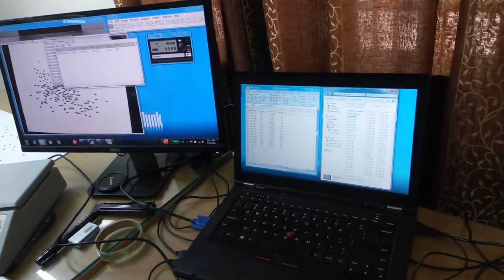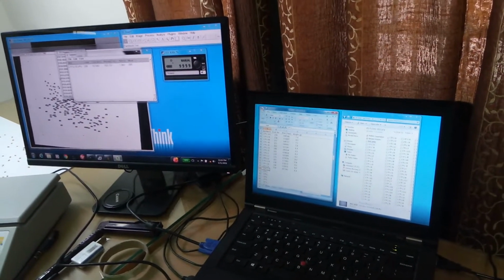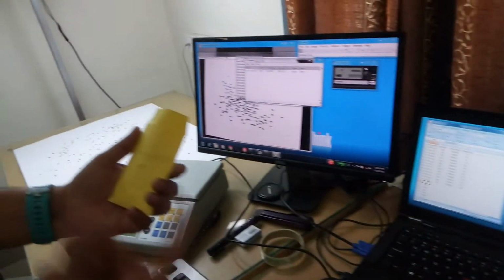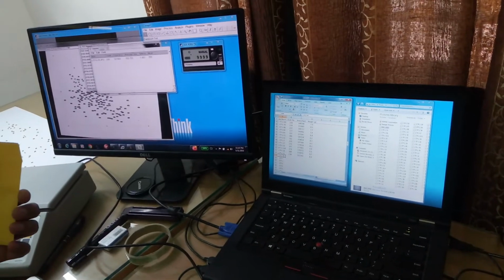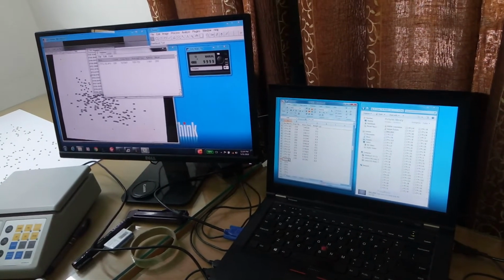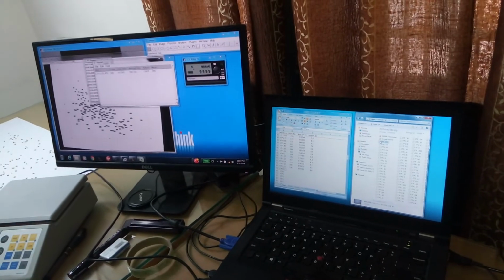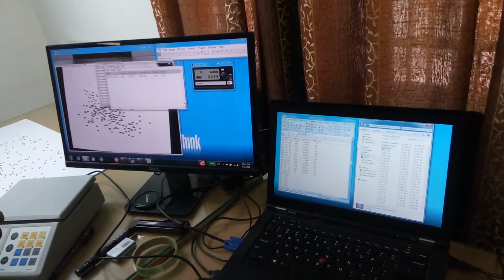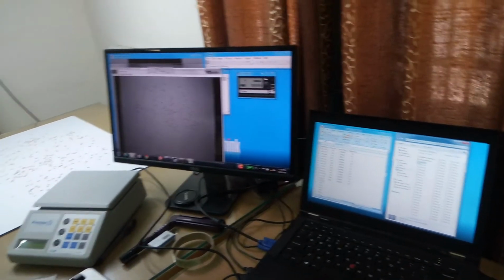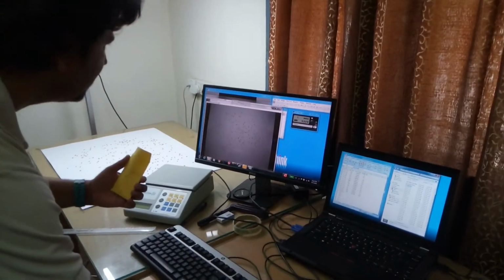And what I do, the sample number, the plot ID, I just name this like 87 LTP, copy it, and then first step is to rename the file so that we can always track it back and enter it again. Now the file is opened in the open source ImageJ program, and follow very simple steps.